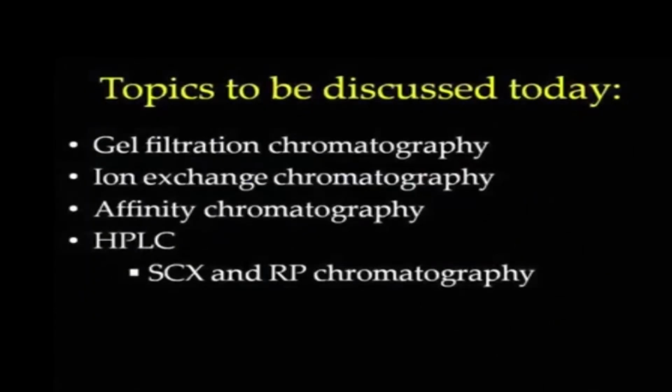So, the lecture outline will talk about gel filtration chromatography, ion exchange chromatography, and affinity chromatography. These methods will be discussed in light of protein purification, and then we will talk about a few methods such as strong cation exchange and reverse phase chromatography for peptide isolation using high performance liquid chromatography methods.